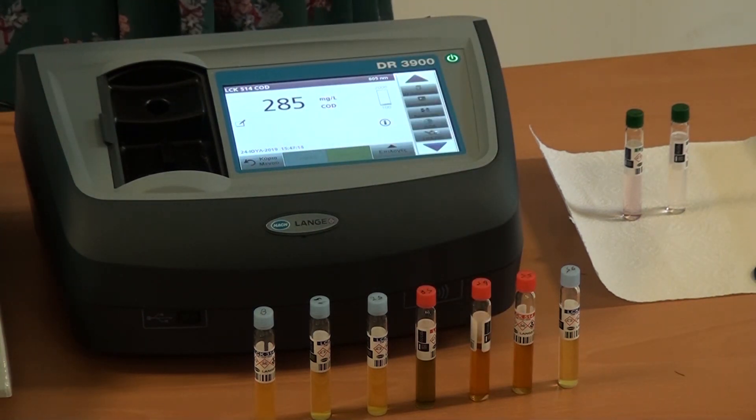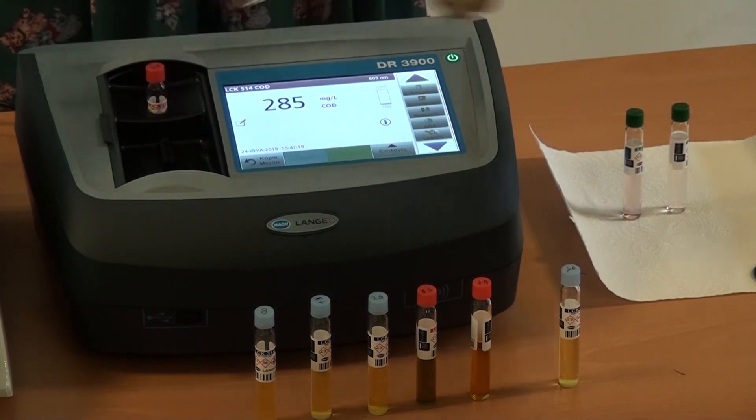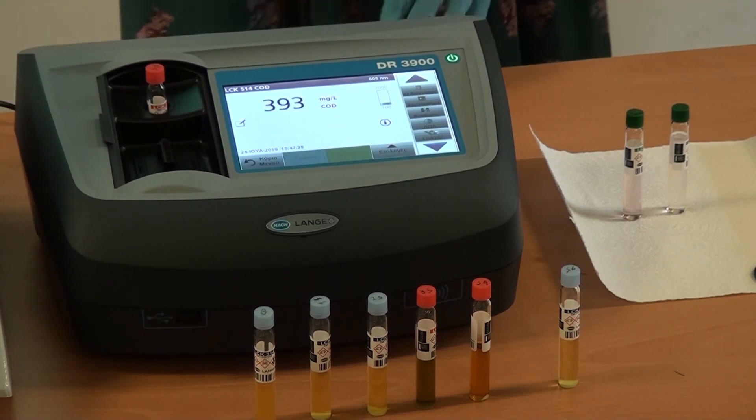Somebody else — 400. Also a known sample. Very good. 293.